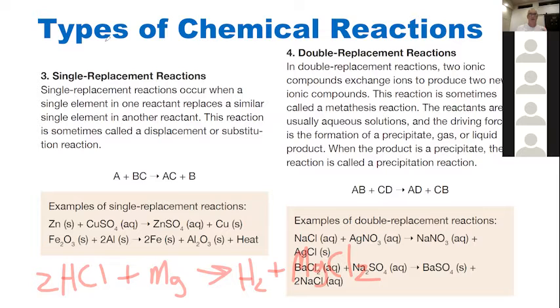Basically, hopefully you guys have some concentrated HCl. You're going to want 1 molar HCl for that reaction. And you'll notice when it comes in contact with the magnesium, bubbles instantly start to form. And those bubbles are hydrogen. And we're going to see the hydrogen being produced.